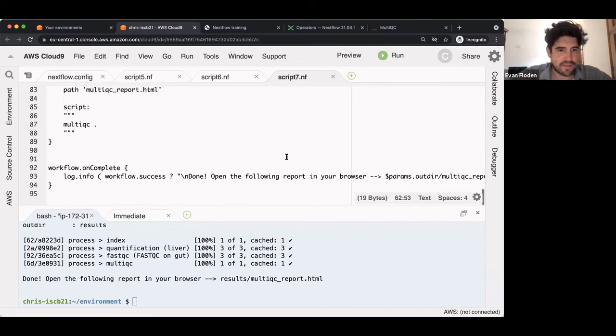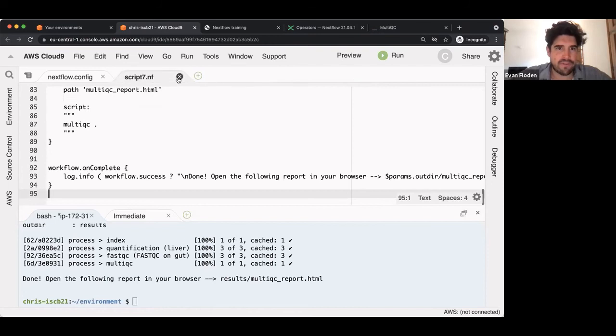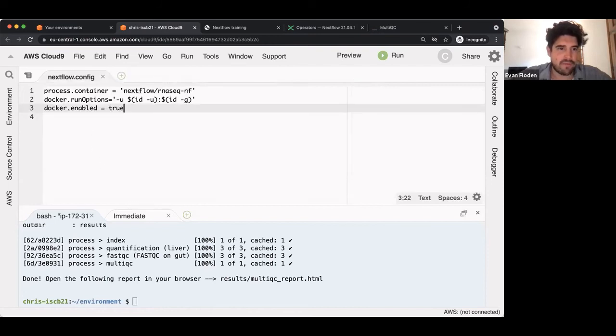Last thing before we take a break, I think this is kind of super cool. So far, there was a question before about the project directory. We're running local files so far. So this is like a .nf file in this local machine. But what happens if I want to go run something from GitHub? And we mentioned before, everything should be a Git repository. How can we launch the same pipeline from GitHub?